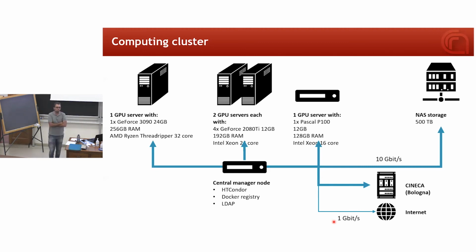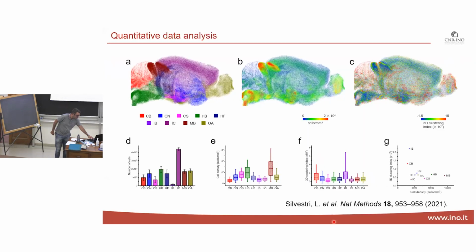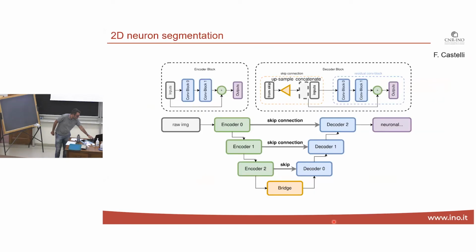What do you get scientifically out of collecting these? Two examples come to my mind. At the moment, as I was saying in the presentation, this particular project with the NIH has more of a technological footprint rather than a scientific one. Other projects also investigate, for example, samples that come from children with different degenerative pathologies. And we can see how the pathologies affect the cortex.